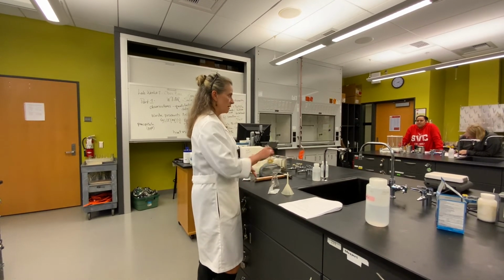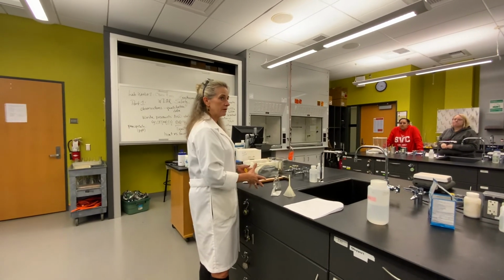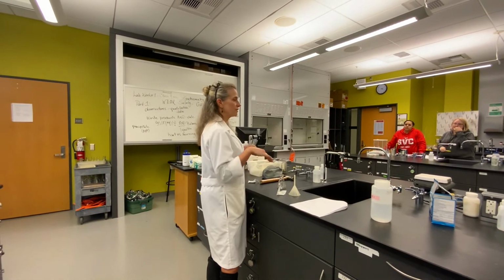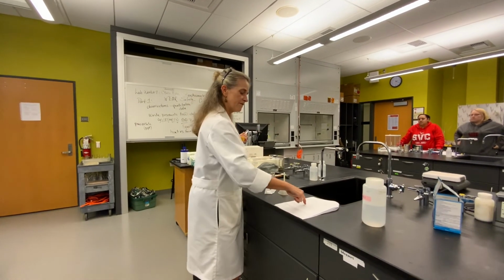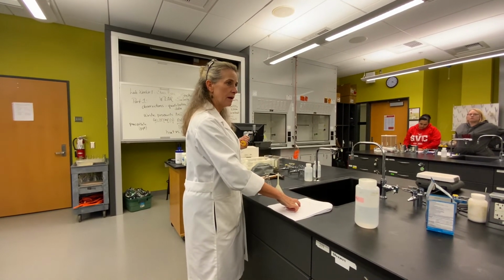Same thing, add hydrochloric, slowly swirl, slowly swirl, slowly swirl. It will look cloudy. And then same thing, you're going to stir it and heat it. When you think all the CO2 is gone, then you mass it. And I forgot to say this on the last one, but that final mass of Erlenmeyer and products, it's really important to get on the table, okay?